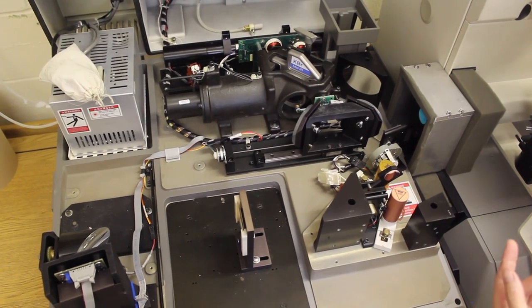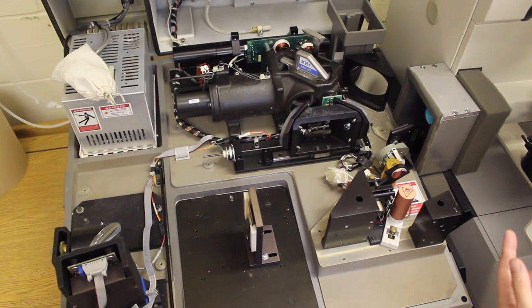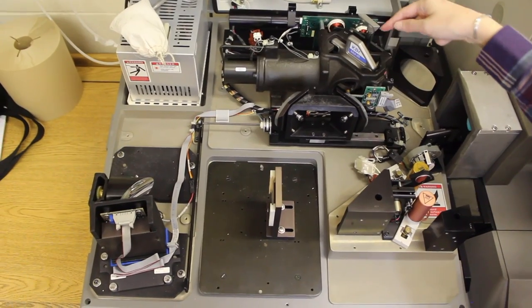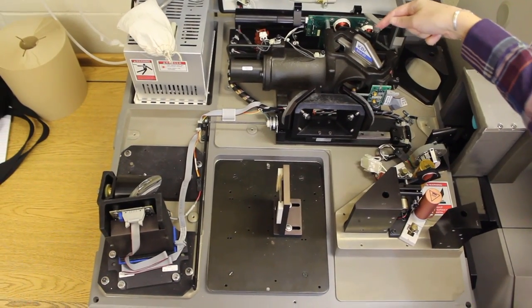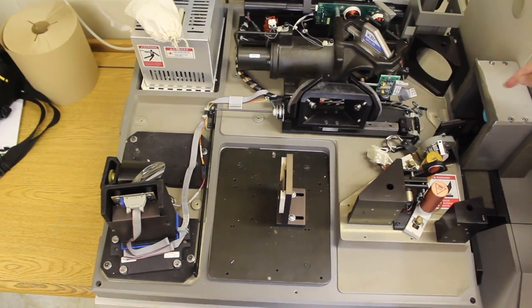There's also an option to move the mirrors in front of the interferometer so that the light enters the microscope instead.